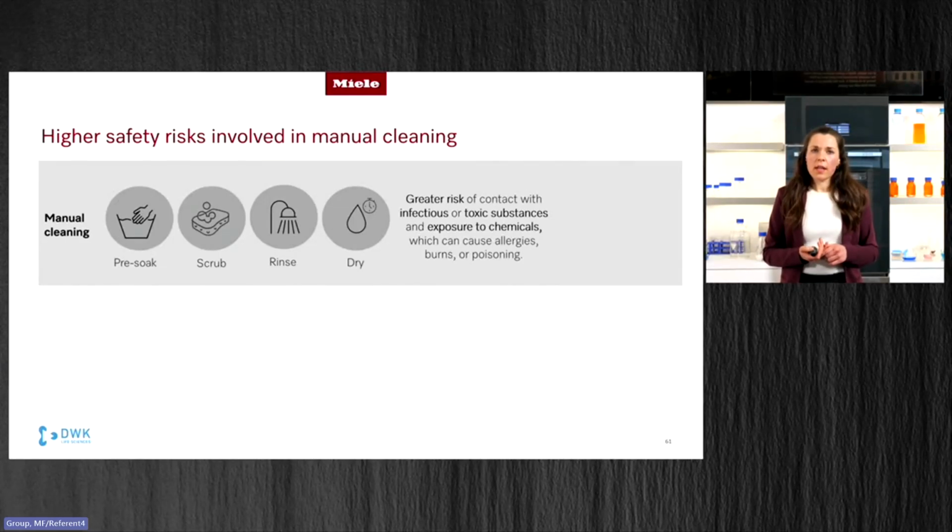So there is in general a higher risk of burns, allergic reactions, or other health-related issues. Overall, there is a higher risk throughout the process for the laboratory staff.